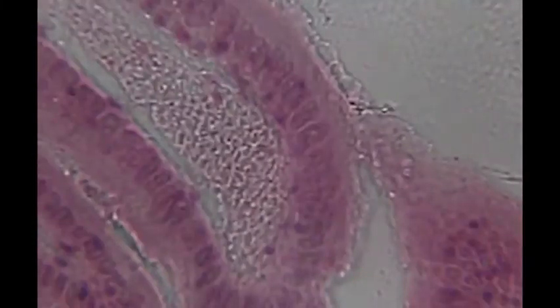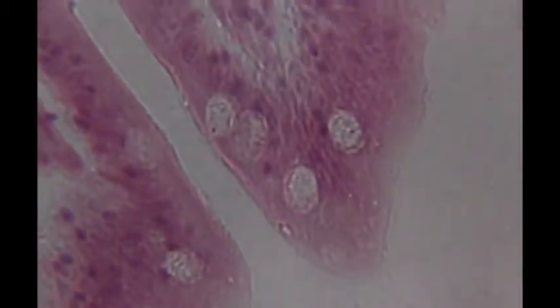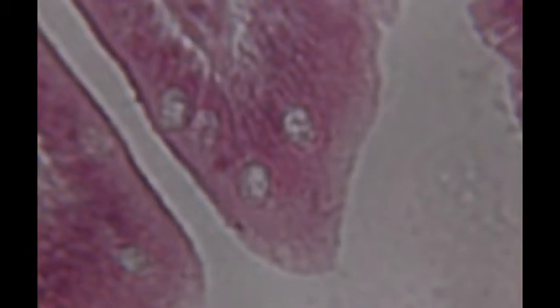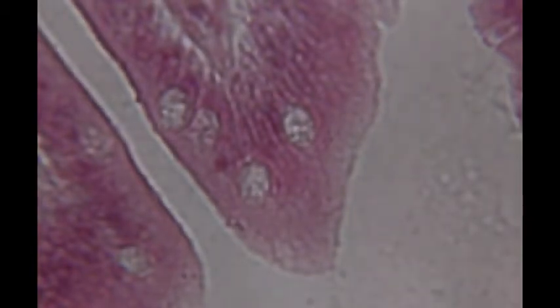I'm going to look and see if I can't find a section that shows a couple of different things. Here we go. This is an example of the simple columnar epithelium, and you can see a cell here with its nucleus, a cell here with the nucleus.